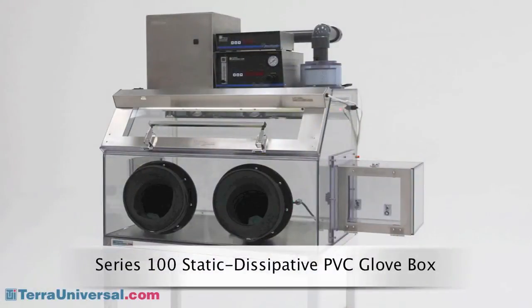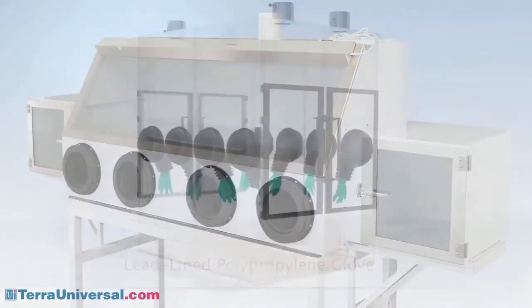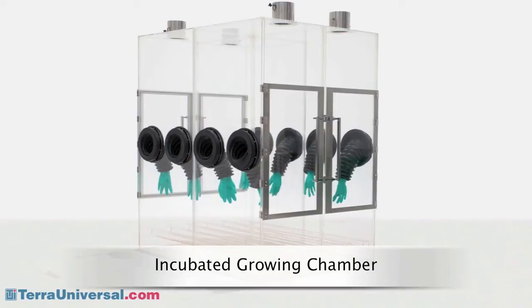Static dissipative PVC offers wide chemical resistance and eliminates static charge buildup. It also prevents static cling, which can turn an acrylic chamber into a dust magnet. Polypropylene is ideal for use with acids and other harsh chemicals. Polycarbonate provides greater thermal resistance for custom applications that require elevated temperatures. Tera can also incorporate FM 4910 listed materials to meet fire safety requirements.